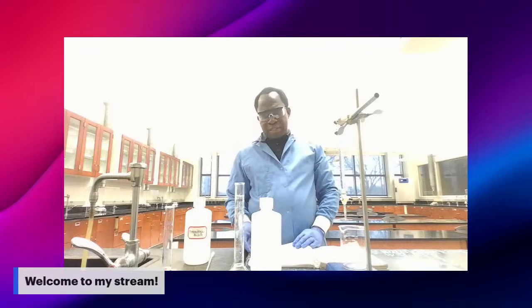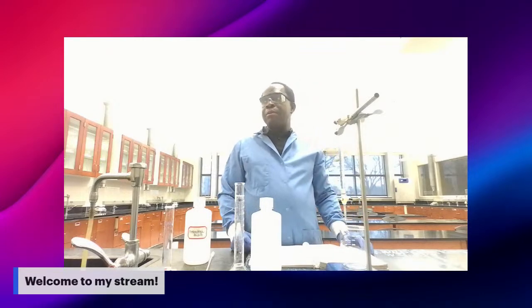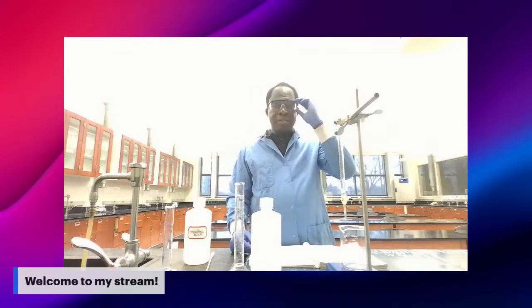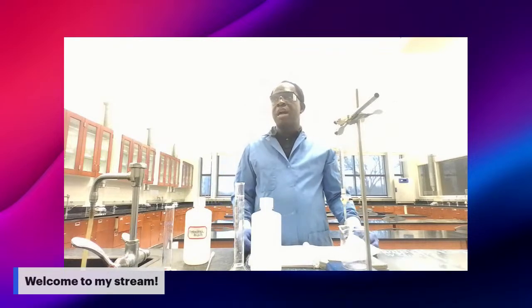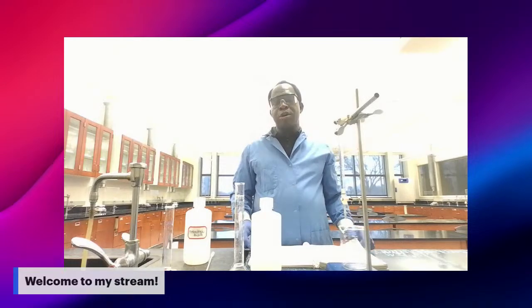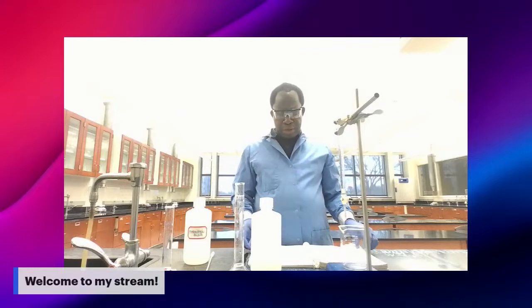Okay, but before we start, I want to just remind you of some of the safety rules we have in our lab. You need to have your safety goggles, your lab coat, plus closed-toe shoes on anytime you are coming to lab to perform lab, and make sure you have all those on all the time.